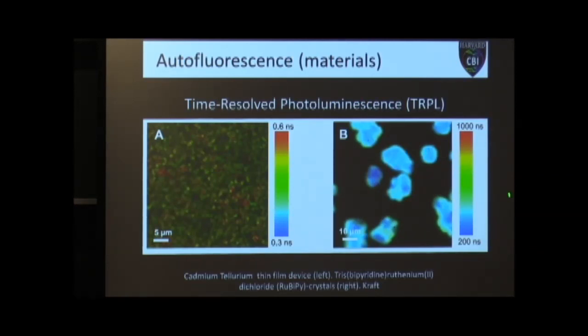And over on the right-hand side here, this is just another image of some crystals, and essentially you can start to see different components of the crystal based on the lifetime.